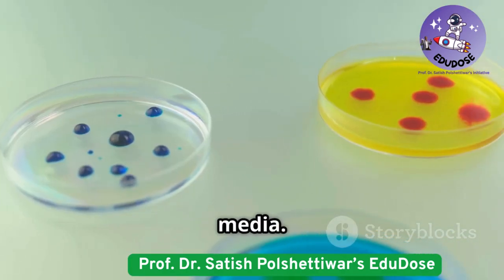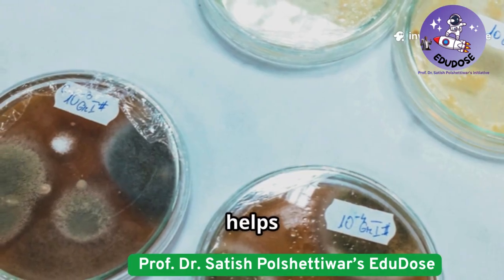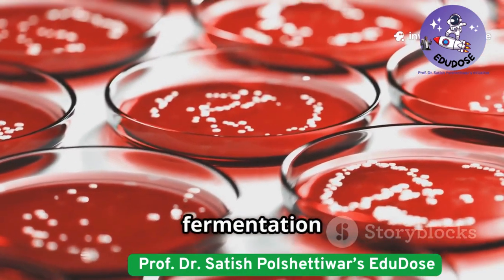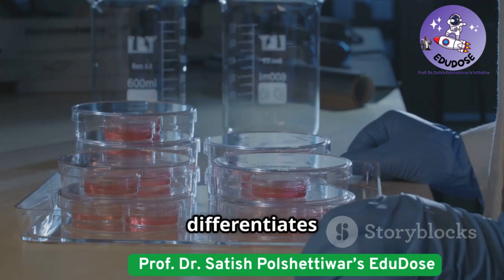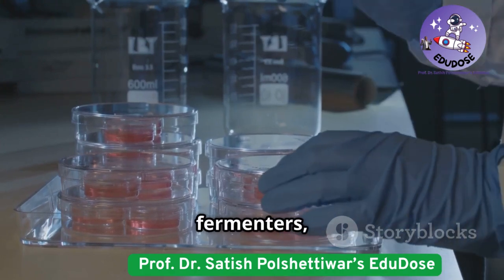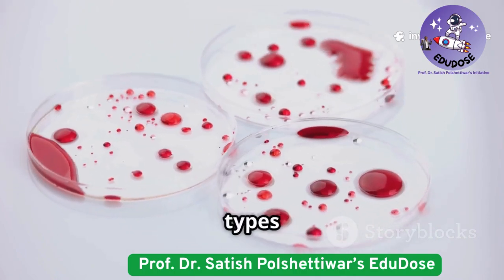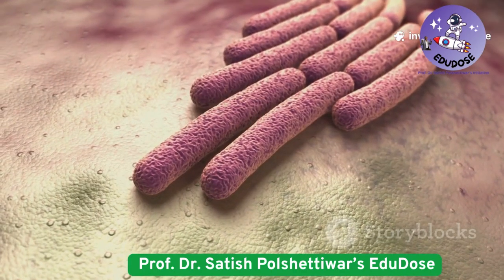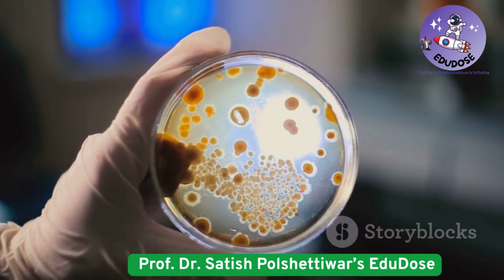Now, differential media. Here's where things get interesting. Differential media helps us tell microbes apart based on their biochemical reactions, like sugar fermentation or hemolysis. Take MacConkey agar again. It differentiates between lactose fermenters, which turn pink, and non-fermenters. Blood agar shows different types of hemolysis: alpha, beta, or gamma. This is super useful for identifying enteric bacteria and streptococci.